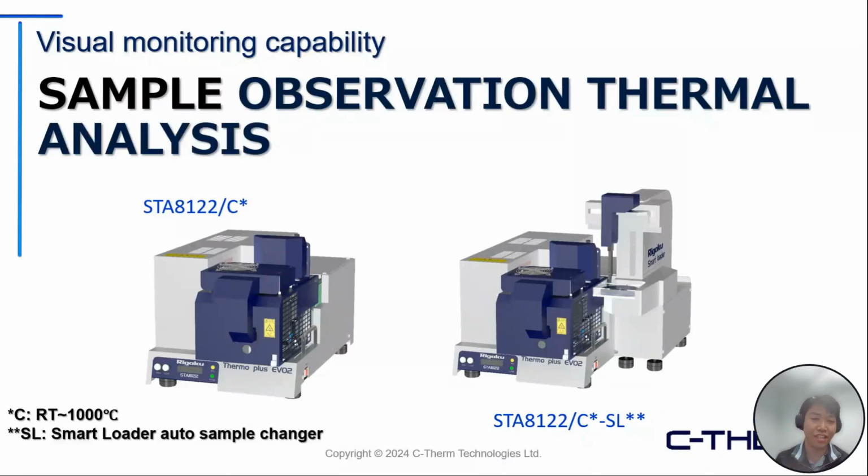Sometimes a sample might undergo a very rapid series of thermal events, but it is very hard to interpret what could be going on with just TG and DTA curves or DSC curves. So being able to directly observe the sample as the measurement takes place really allows for more confident data reporting and analysis of the data.